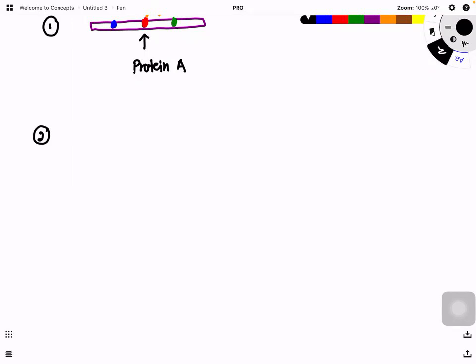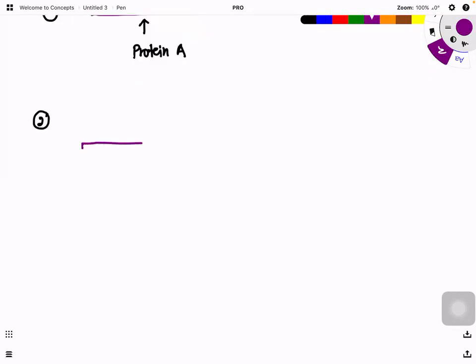So what we're going to do here is very simple. Let's say I want to target two proteins, protein number one and protein number two. You want to check these two proteins. What we're going to do here is I have the monoclonal antibodies that target them, okay, sorry, used by the same color.